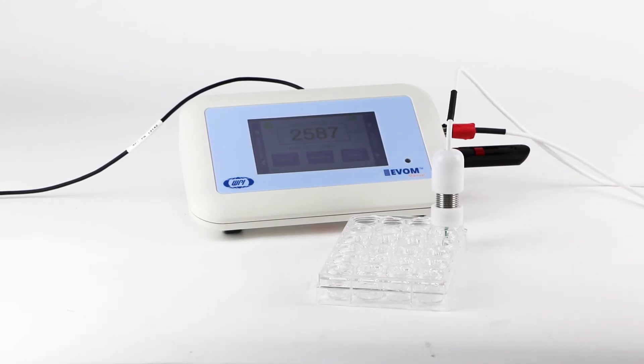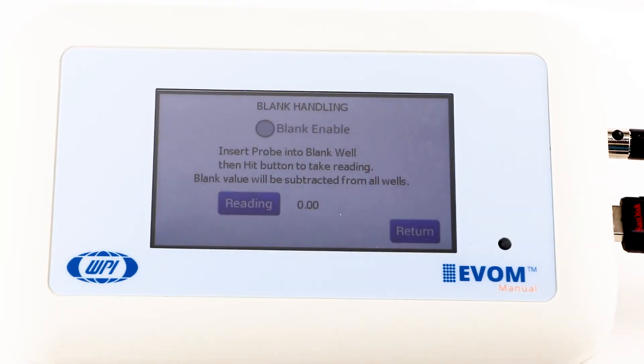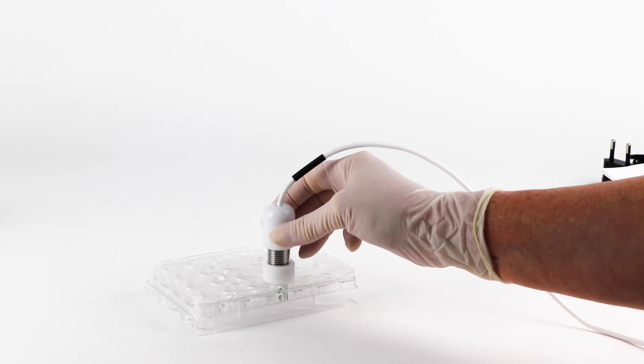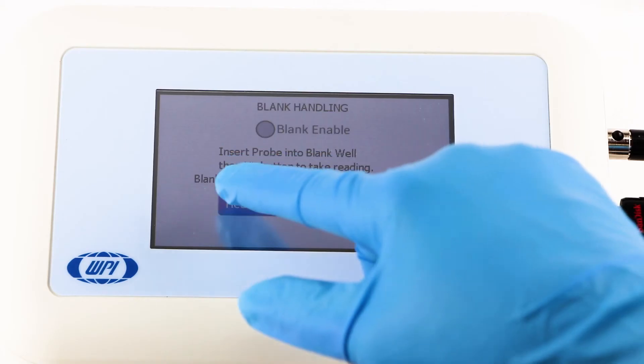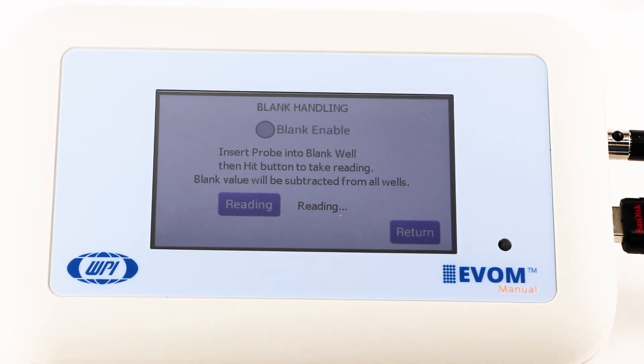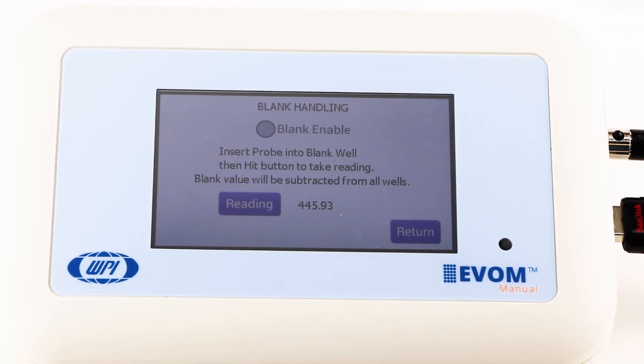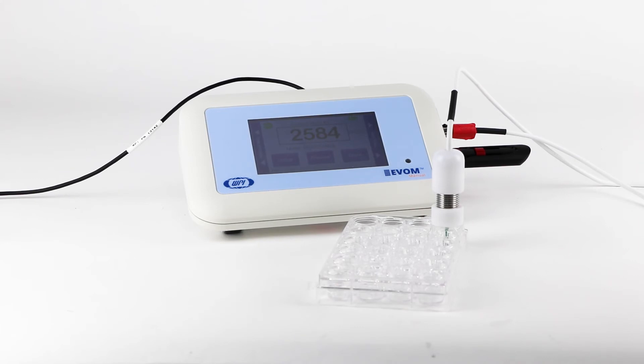To subtract a blank trans well, including the fluid and the electrode resistances, first press the blank handling button. Then place the electrode in a blank well and press reading. Press the blank enable radio button to automatically subtract that blank value from your future readings.